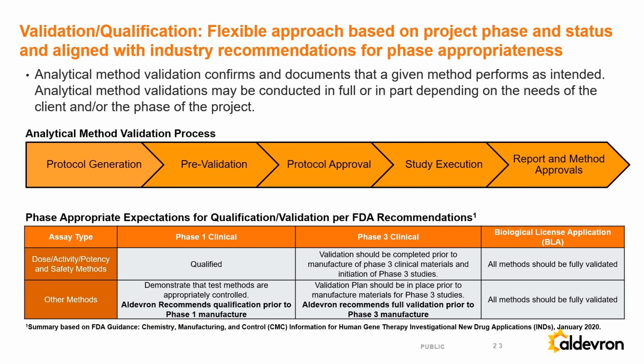One thing that's interesting when we have these discussions with different folks in industry is that terminology becomes important. When we use words like validation and qualification, sometimes they don't mean the same things to everyone. For the context of this discussion, qualification is an industry standard term that can encompass a number of different activities.